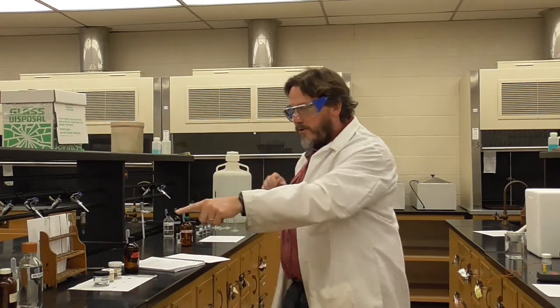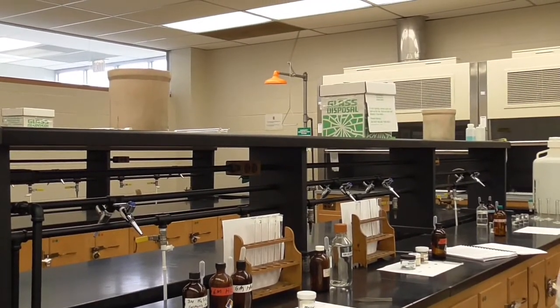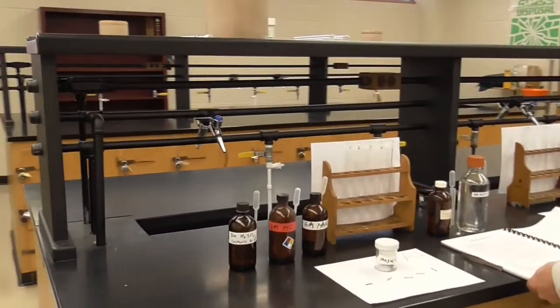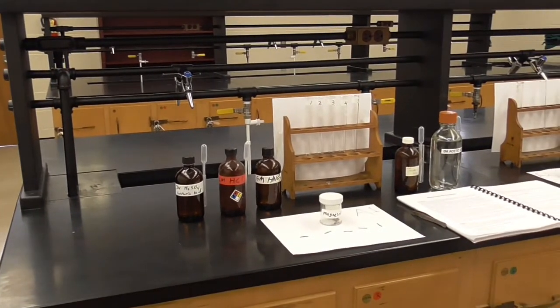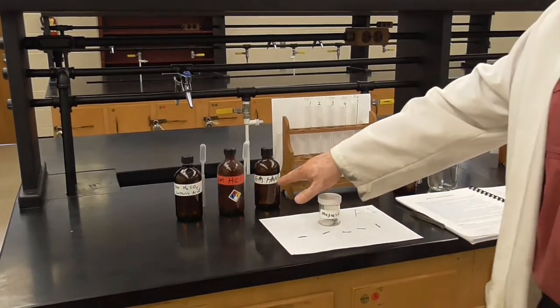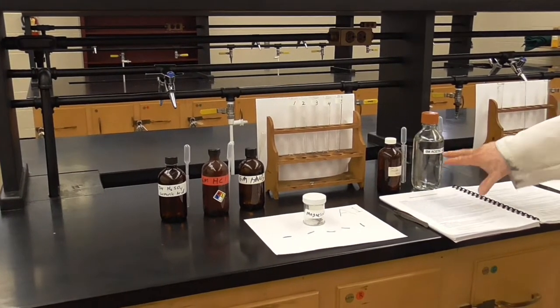Okay, so for our first part, part A, we're going to go over here. This is going to investigate the nature of the reactant. So I'll let Dr. Shin, who's running our camera for us, zoom in on this. And let me get the procedure so I can follow along. We have, in this part A, 5 different acids. Over here we have sulfuric acid, hydrochloric acid, nitric acid, phosphoric acid, and acetic acid.